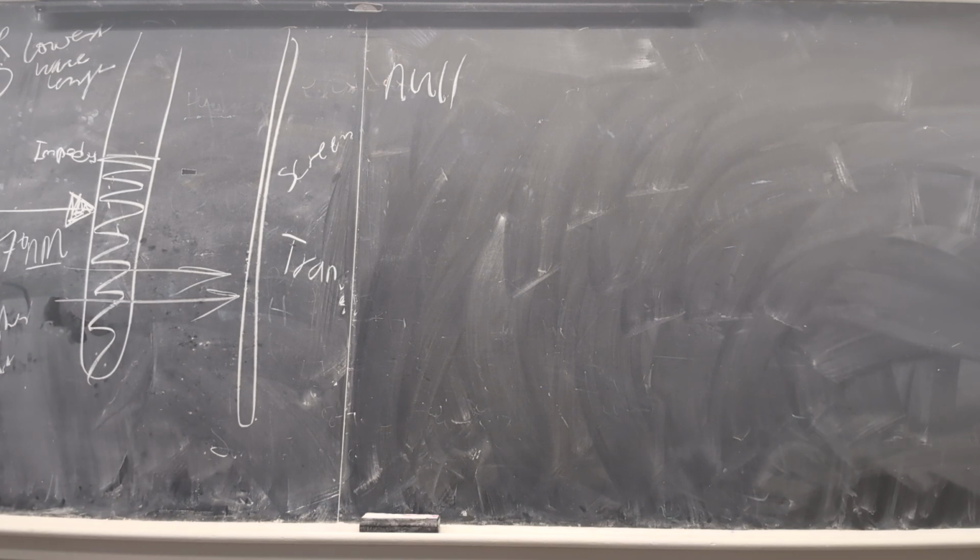What are we doing, Professor? So we're putting the pH inside the vial. Do not put different. Did you put a different pipette in a different pH? It's the same one. Just use it once, and for the rest use a dropper, because that's gonna take forever. You're gonna use a different pipette for a different pH.